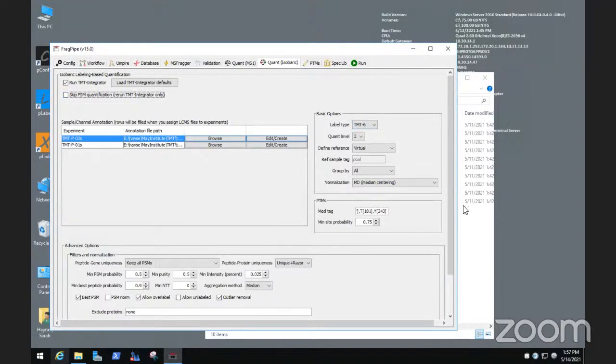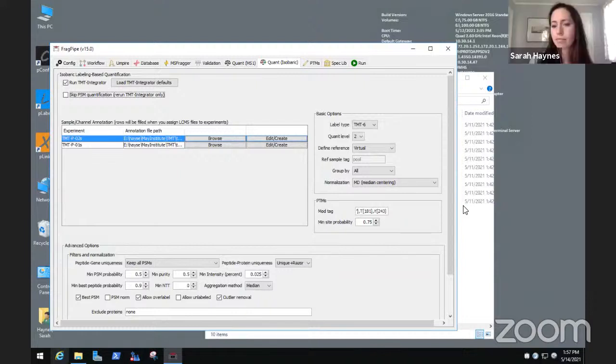The aggregation method affects one experiment at a time or both? I actually don't understand that question, frankly. Maybe the person who asked, Susanna, can rephrase that, or someone else who understood can ask that.